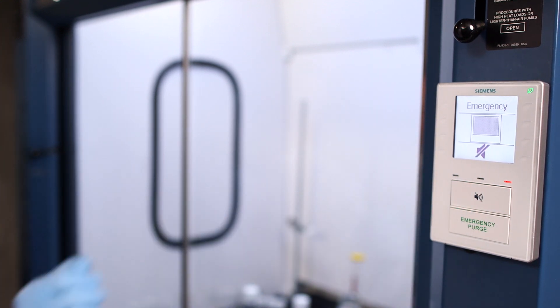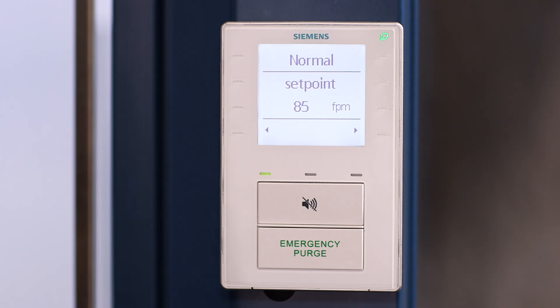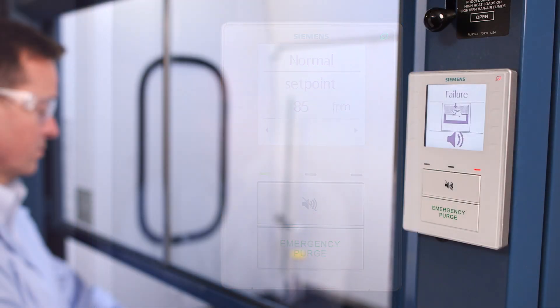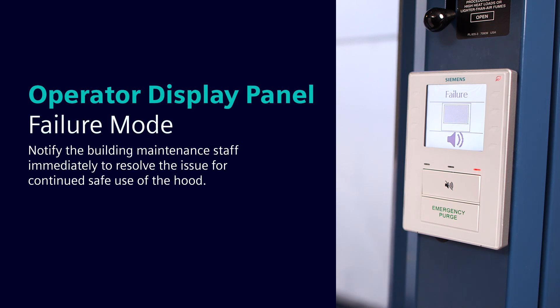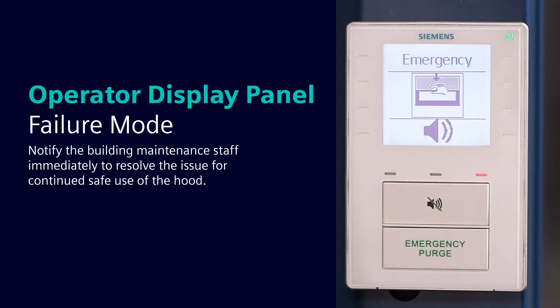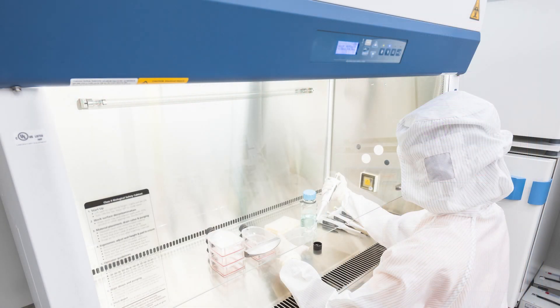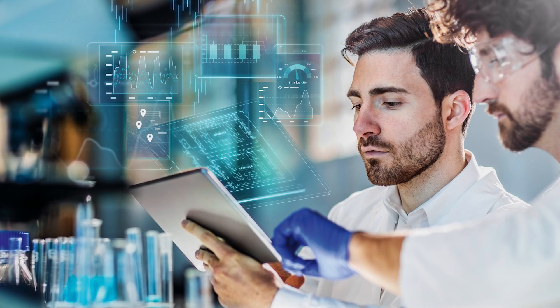The alarm can be muted. When the condition is cleared, the user pushes the button again to go back to normal mode. Remember, failure mode indicates a component in the system has failed — notify the building maintenance staff immediately to resolve the issue for continued safe use of the hood. The Siemens Operator Display Panel is a user-friendly monitoring solution for required fume hood safety standards that keeps the user safe and aware of fume hood status at all times.